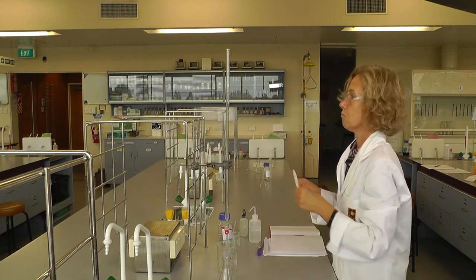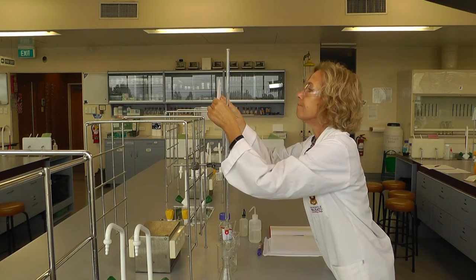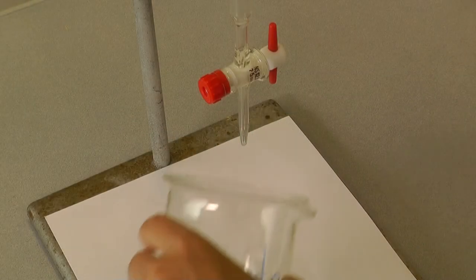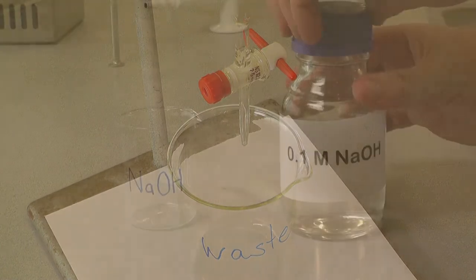Using a piece of paper for contrast and with the meniscus at eye level, take a reading to two decimal places and write this value down. Place a waste beaker underneath your burette to catch any spillage and close the tap.